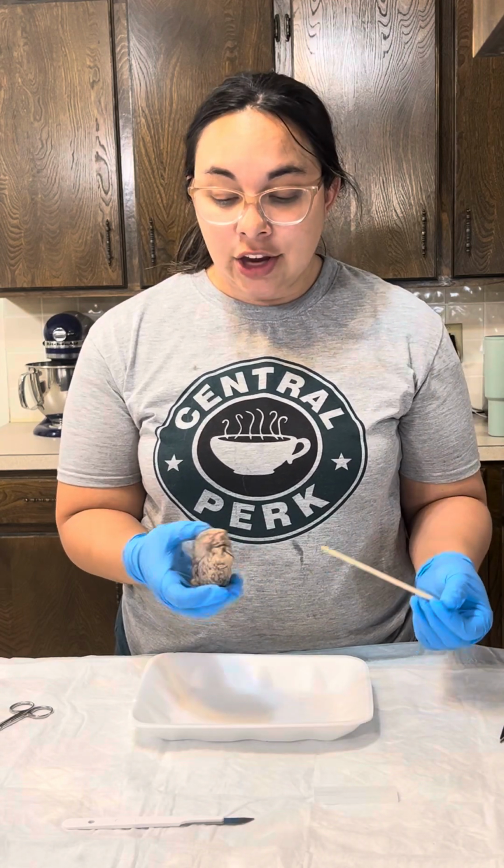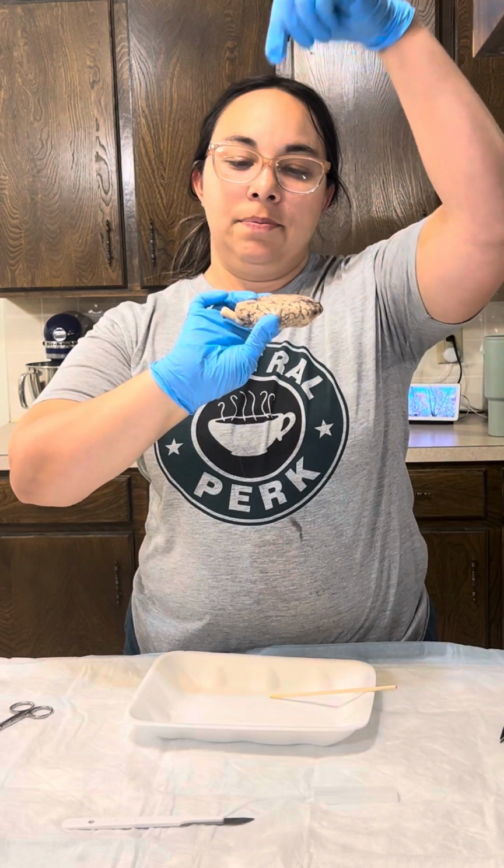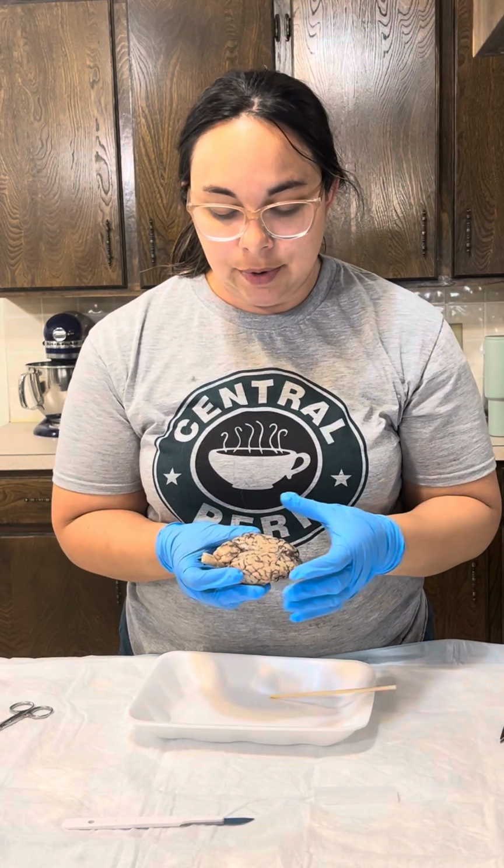So the first thing that we're going to do is identify all the parts on the sheep brain, or any brain. A sheep brain and a human brain are very similar, except for the sheep brain, their lobes, particularly their frontal lobe, is much smaller, as you might imagine. This is the top, if you're looking at it from down at your head. There are three main parts that we want to talk about.